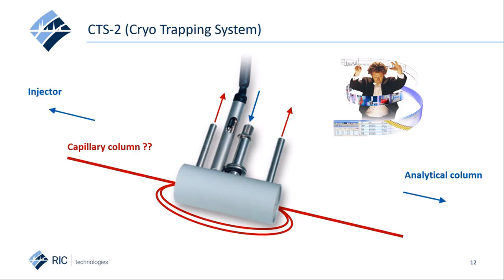What happens now regarding the GC parameters to be optimized to get a proper injection and headspace analysis using on-column refocusing? First, as splitless injection is performed and the volume injected is kept standard, 1 ml, the transfer towards the column is even slower now. So the speed of injection is programmed this way, taking into account the column flow during injection. Instead of injecting at 300 microliter per second, we now lower to 25 microliter per second. This way, not generating an overpressure in the injector.